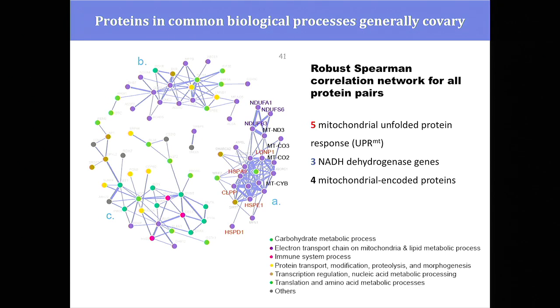And we can ask now, how does the variability of these proteins across all these conditions, how do the proteins co-vary? And this is basically a display of this type of analysis that was carried out. And we see that proteins within particular processes, chemical processes covered by these proteins, tend to co-vary. That means they're probably functionally related. So these processes are carbohydrate metabolism, electron transport, which again has to do with energy metabolism, and some other factors.